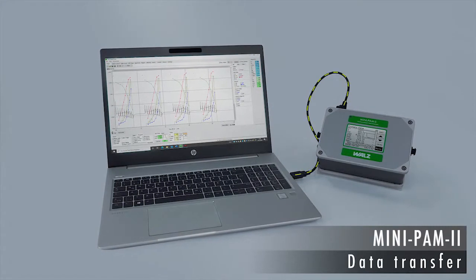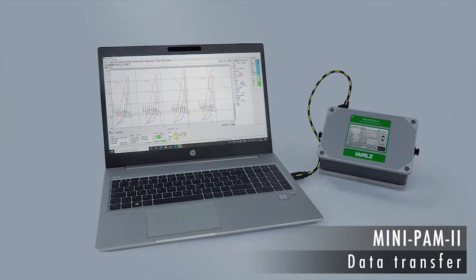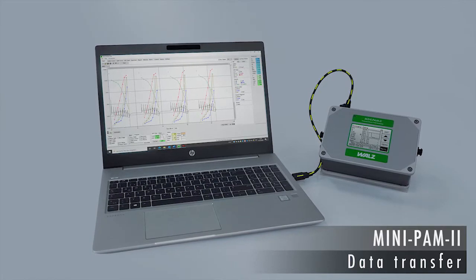The data acquired in the field is easily transferred to a Windows computer running the software WinControl 3.